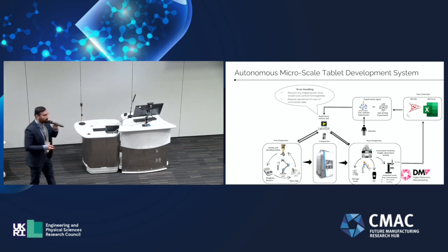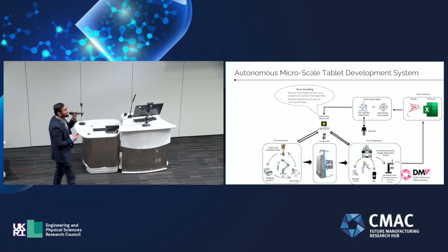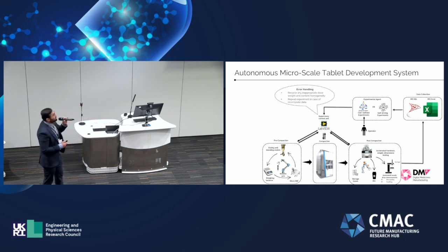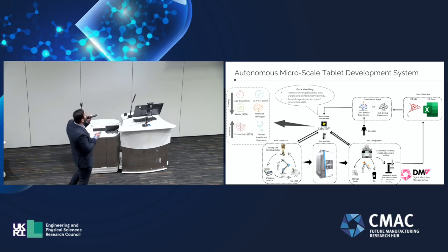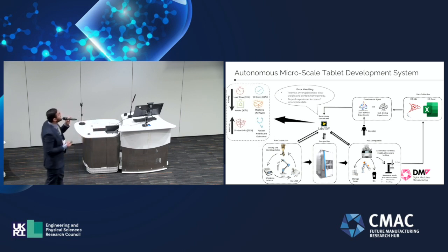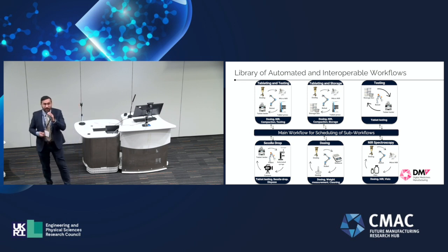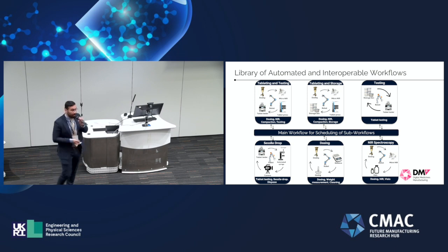The system that we have developed is capable of handling any kind of inappropriate dose, and also the system can repeat any of the experiments in case the data is not complete. So the main target is on collecting high quality data out of this. And eventually the goal is obviously to reduce the lead time and the waste, and increase the productivity in this case. So making the whole system fully automated is not the only target, but in fact we are aiming to help other researchers as well.